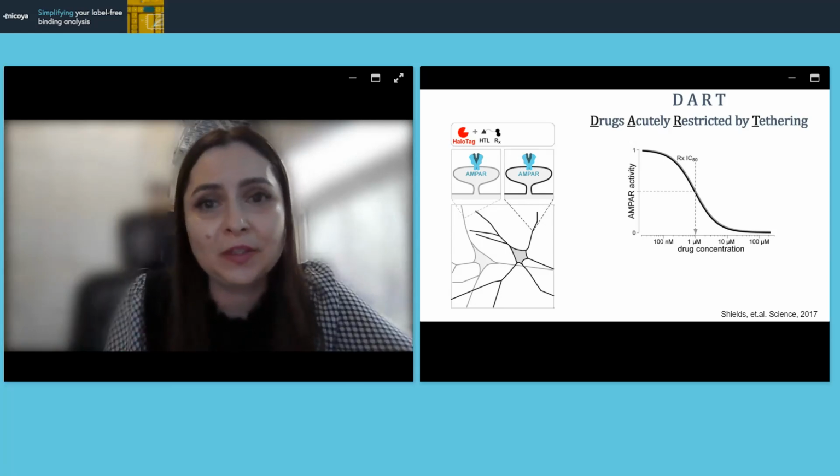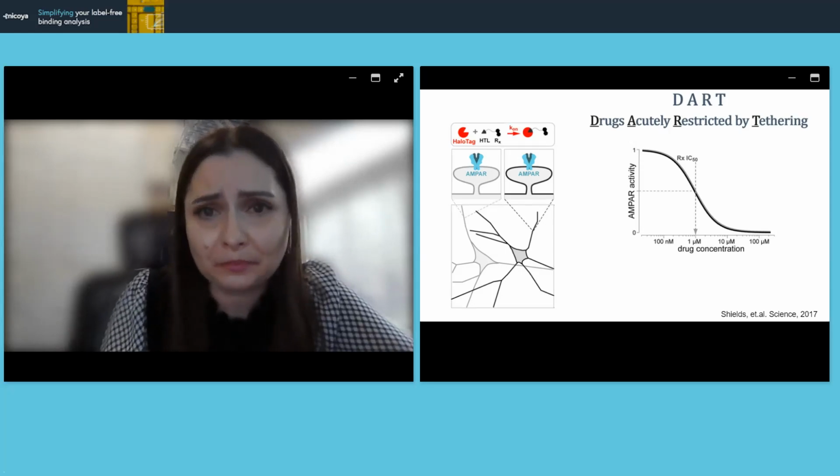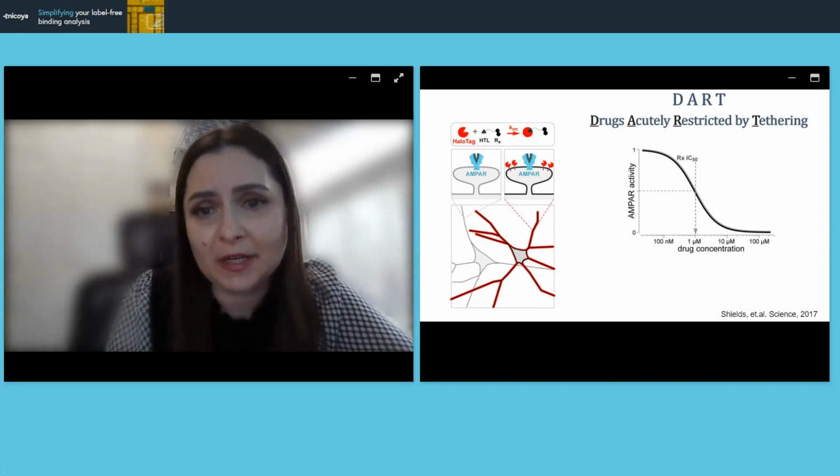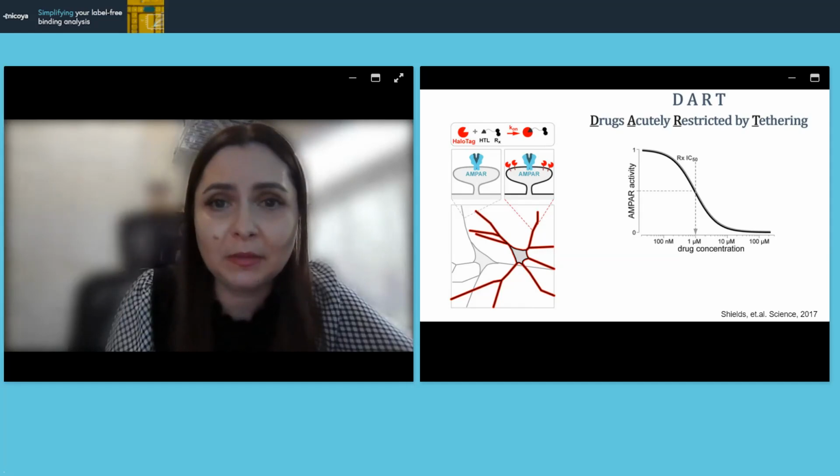And so it interacts with its small chemical molecule covalently, and by tethering the drug that we are interested in delivering to a specific cell subtype, we can actually distinguish those cells. So for example, you can see the red cell expressing our HaloTag protein, HTP.